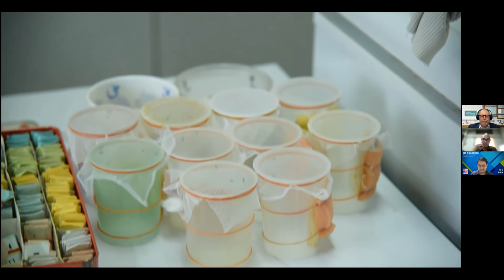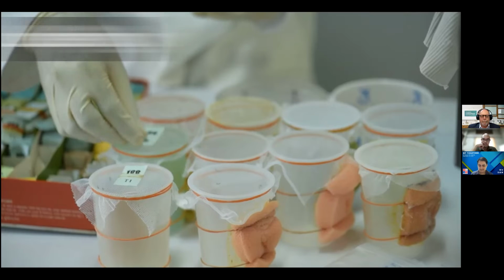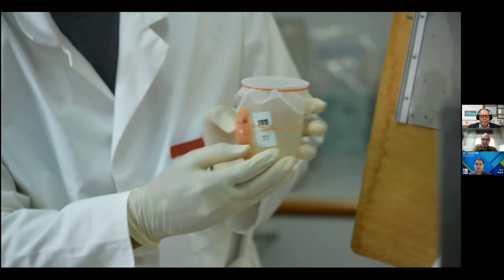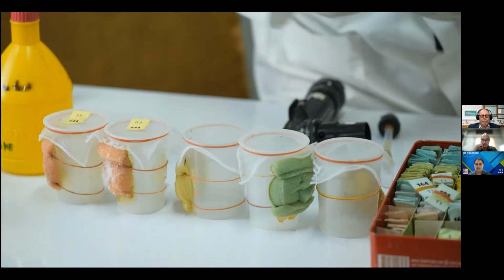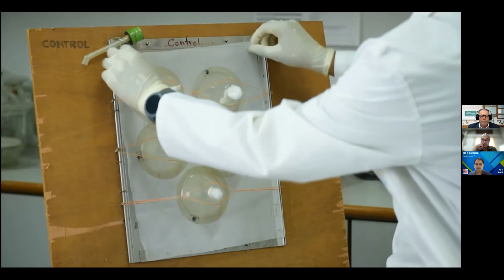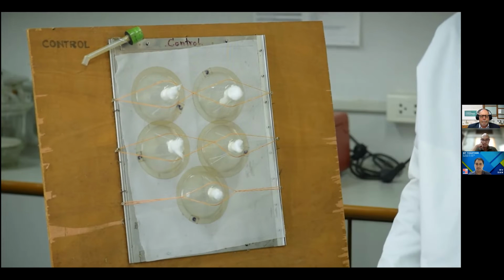So step 1, you mark 10 cups as control, numbered from 1 to 10. So for example, C1 for control, cone number 1, C2, C3, up to C10. And then you mark the other 10 cups as test cones, or cups, also with replicate numbers, such as T1, T2, and up to T10. If there is more than one net to be tested, make sure you adapt the coding so that you can track which net is being tested.